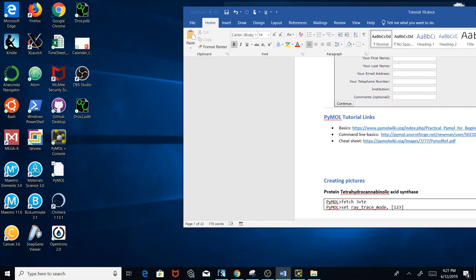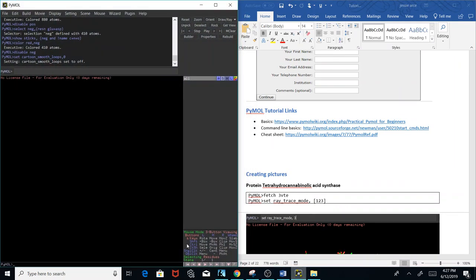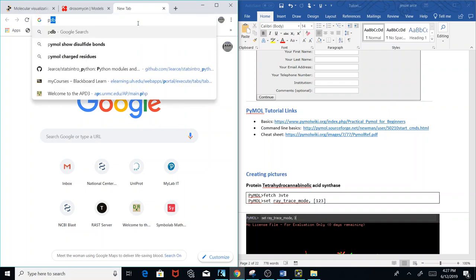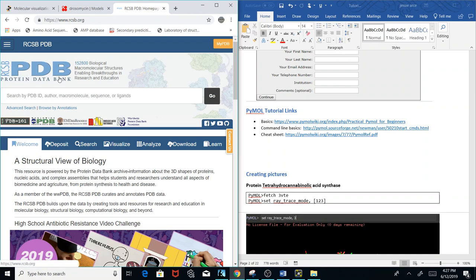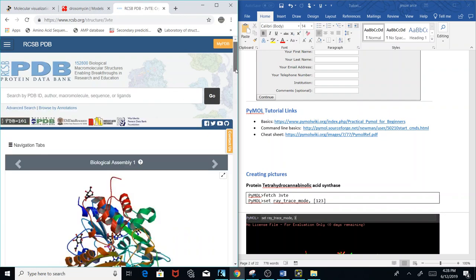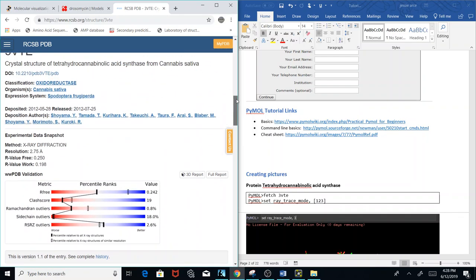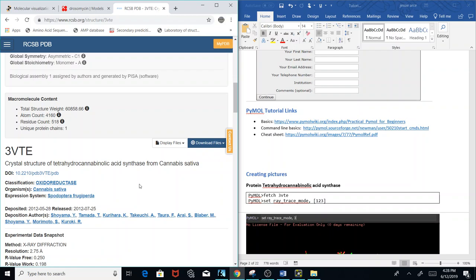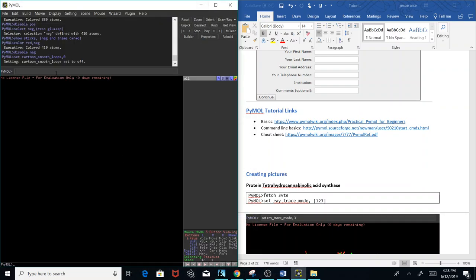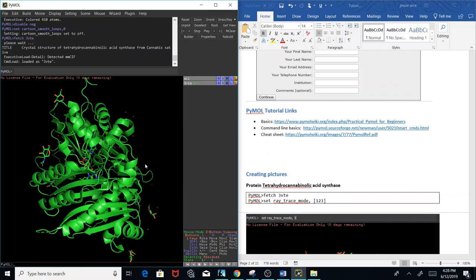We're going to go over creating pictures. I already have a PyMol instance open, and I'm going to go to the PDB databank — the Protein Data Bank, which stores coordinate files of different biological structures. The first picture we're going to create is THC synthase, or tetrahydrocannabinolic acid synthase, from Cannabis sativa. The accession number is 3VTE, so in PyMol I'll type 'fetch 3VTE' and we have our protein imported.